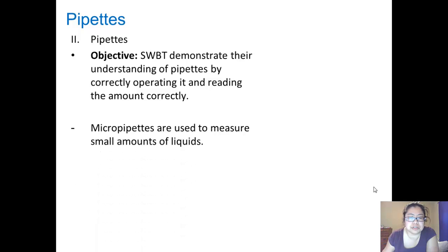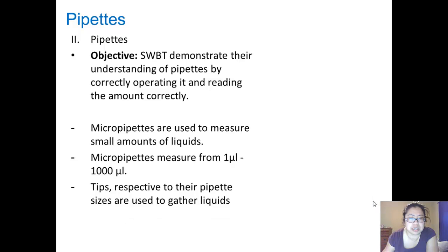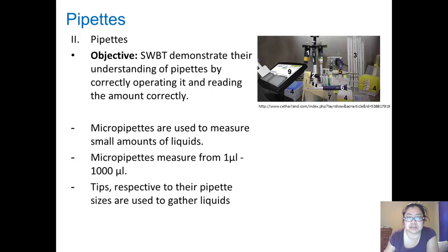Micropipettes are used to measure small amounts of liquids. Micropipettes measure from one microliter up to a thousand microliters, and their tips, respective to the pipette sizes, are used to gather the liquids.